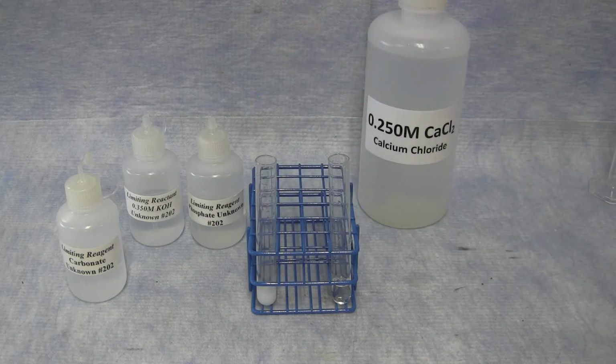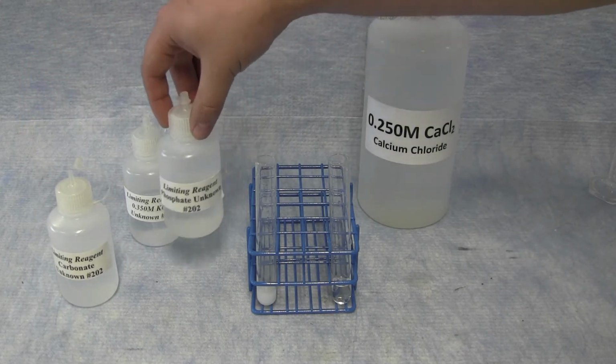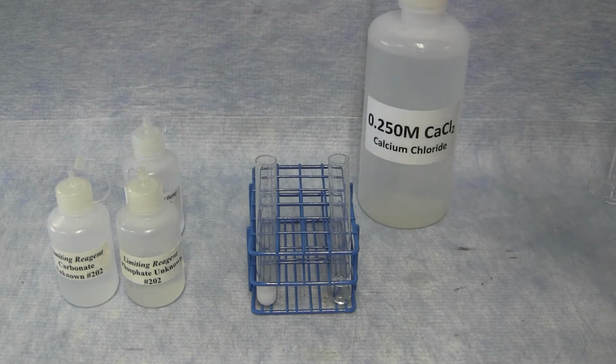You will continue this and perform the same setup with both your carbonate unknown and your phosphate unknown. Both of these are considered qualitative tests. You're determining what is the limiting reactant, and that's all.